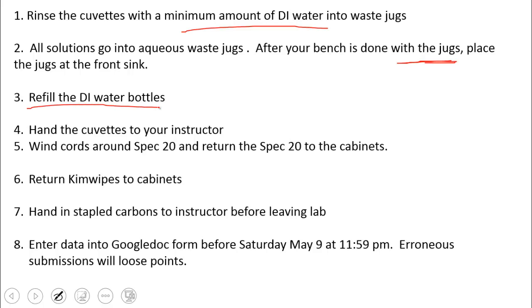Please refill your DI water bottles before returning them to the cart. Physically hand in your cuvettes to me because I want to make sure that they are not left in the Spec 20s when you return the Spec 20s to the cabinet. Wind the cords around your Spec 20 nicely and put them back in the cabinets.